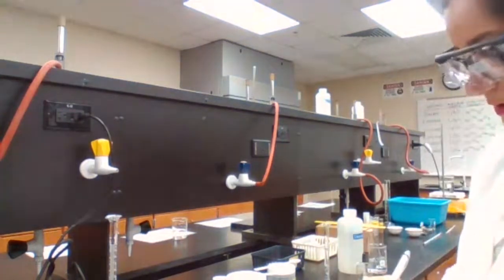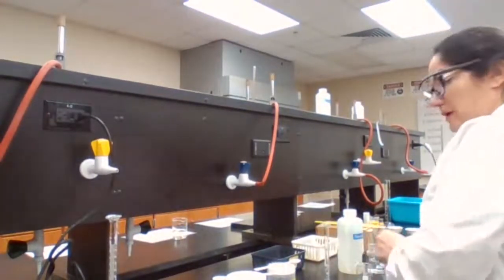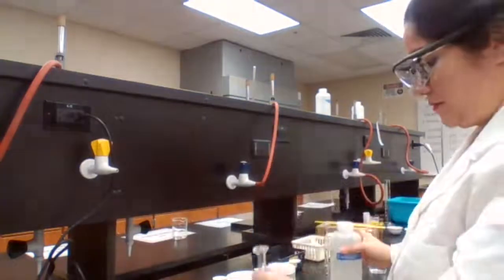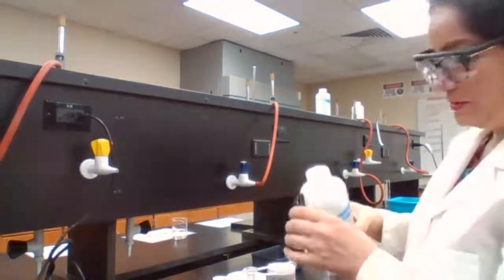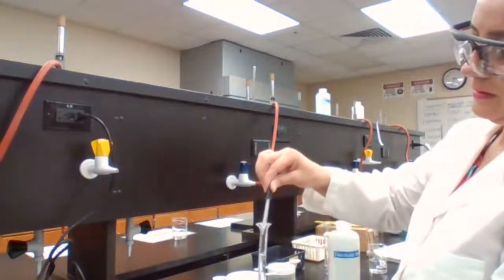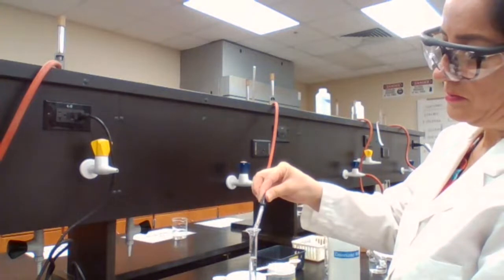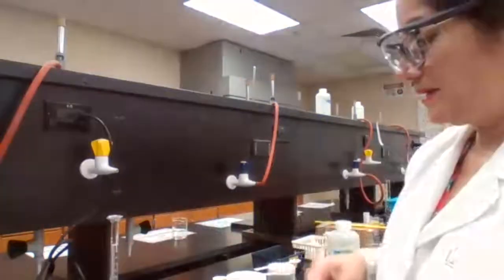So I have a 37.862. Then I add 10 milliliters of water. I pour fast with the wash bottle and then adjust the last drops with the dropper. The 10 milliliters. Now we get the mass again.